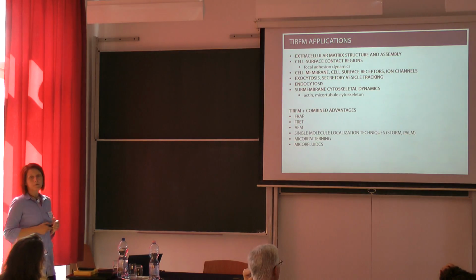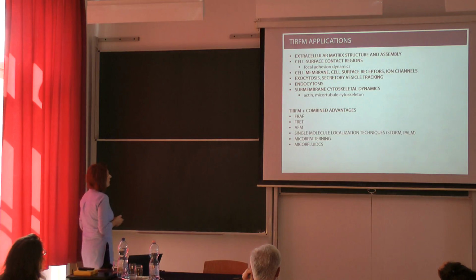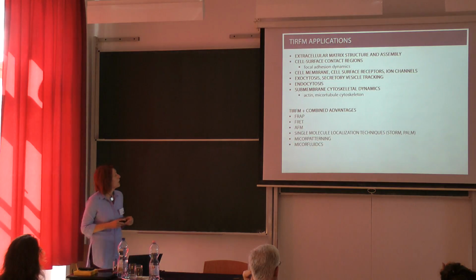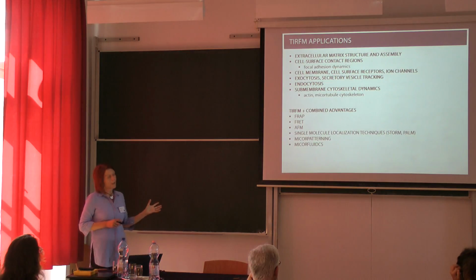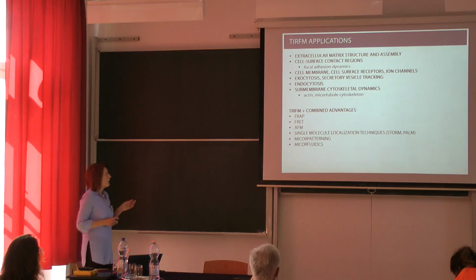You can also combine it with fluorescence resonance energy transfer, or the technique was used in combination with atomic force microscopy. It was the basis for single molecule localization techniques such as STORM and PALM.